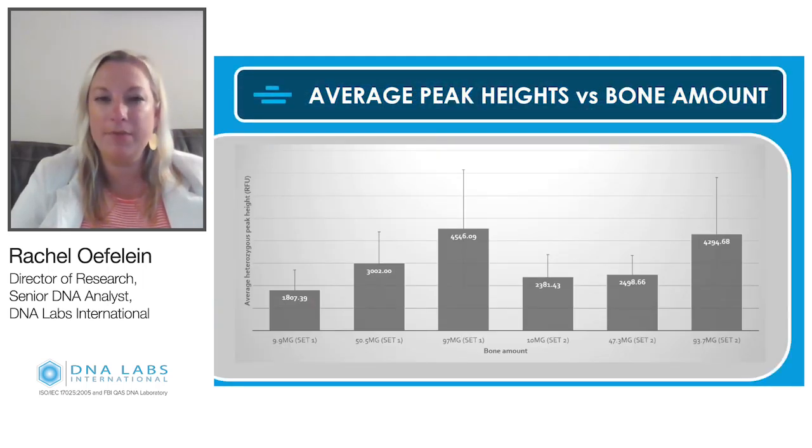I will give the disclaimer from those two that this was before we had set our AT. So our analytical threshold is actually a little bit higher. So a lot of those might not have come in, but for the really tall peaks where we're seeing that bifurcation, those are absolutely still going to fall in at that 100 milligrams.